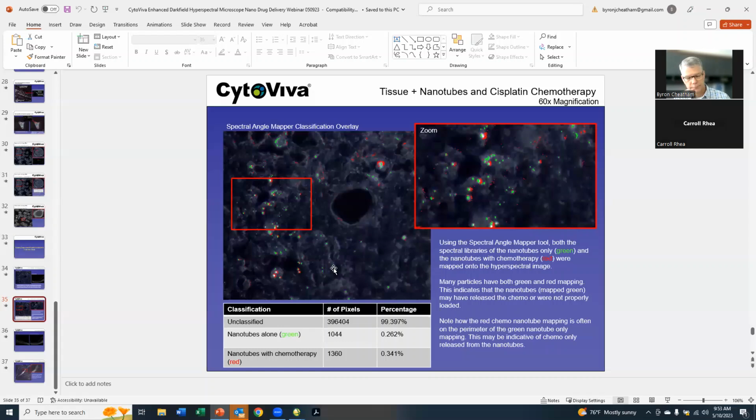Perfect. Thank you. Jordan asked, we often work with RNA or DNA therapeutics. Can they be spectrally imaged in cells when delivered with polymer conjugates or nanoparticles, or are they too far towards the UV?